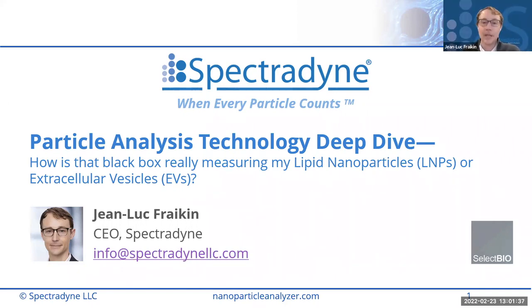Thanks very much, Inal, and welcome to everyone attending today, and thanks for your time for joining us. In this webinar, we'll ask the question, how is that black box really measuring my lipid nanoparticles or extracellular vesicles? And we'll do that by investigating in detail how the most common techniques work and what kind of information they deliver about the samples you're trying to measure. I hope that you'll come away from this with a deeper understanding of the measurement techniques you're using, and ultimately that your science will be better, faster, and easier, because that's what we all want as scientists, right?